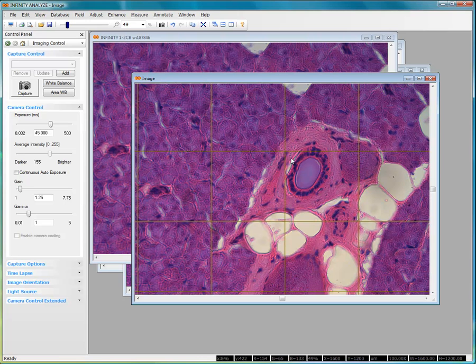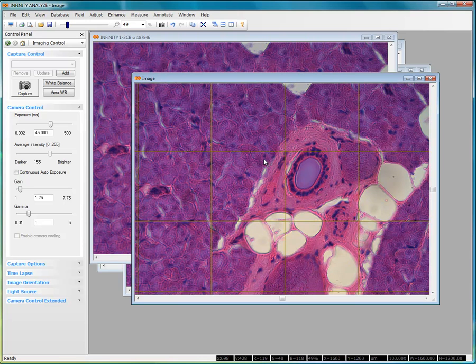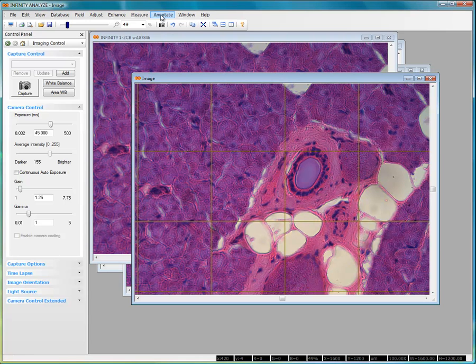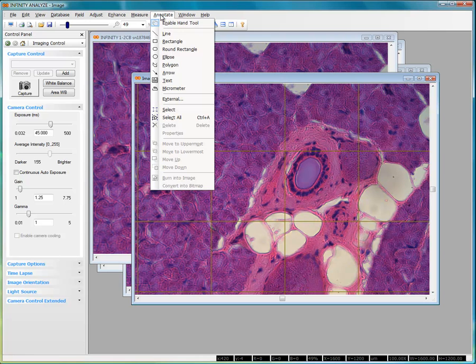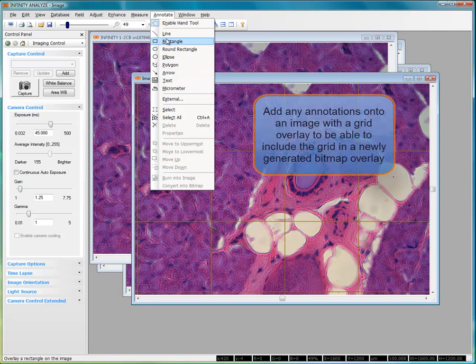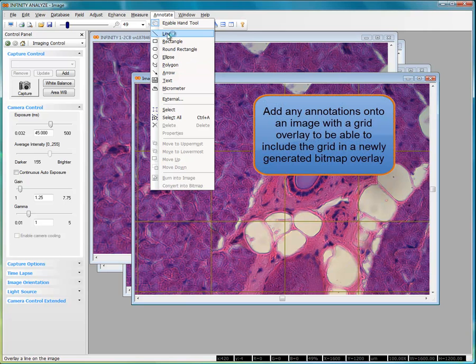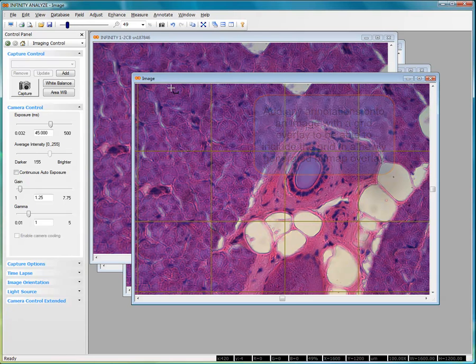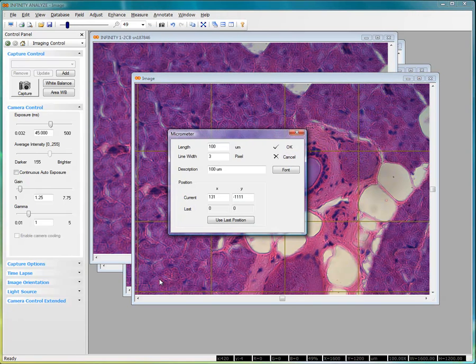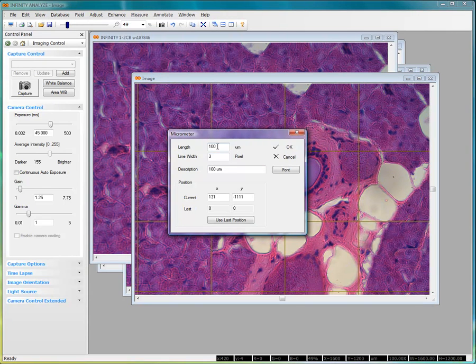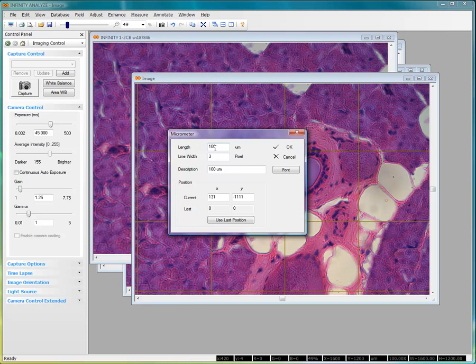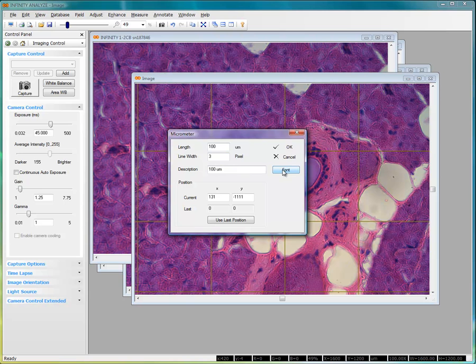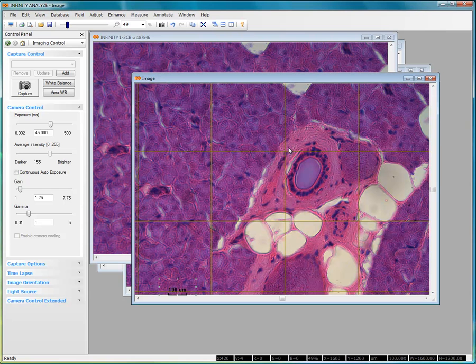Now grids on their own cannot be burned into Bitmap Overlay images, but if we select to place some other kind of text or line work, any other kind of annotation on here, or a micrometer bar, and we can position a micrometer bar, and as I said, I'm not calibrated at this particular time. However, I'll just illustrate positioning a 100-micron micrometer bar on here.